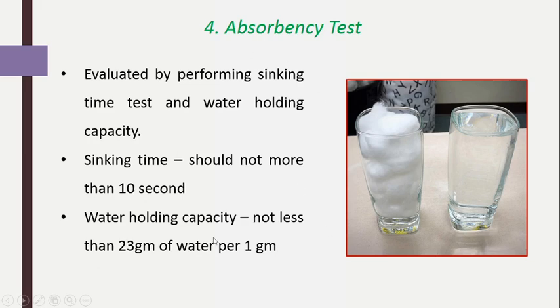Just remember that the absorbency test is done by evaluating the sinking time and the water holding capacity of the absorbent cotton. Next, we will see the fluorescence test.